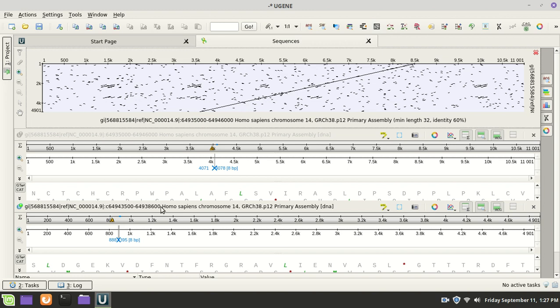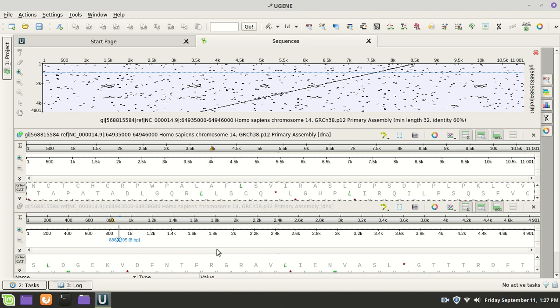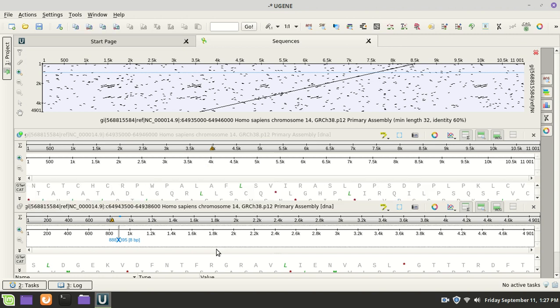Let's see, do we have the... and then this one is the other one.